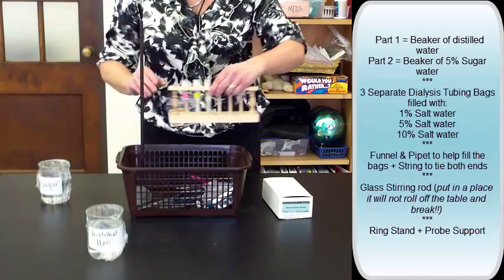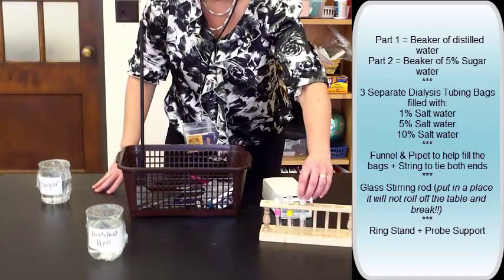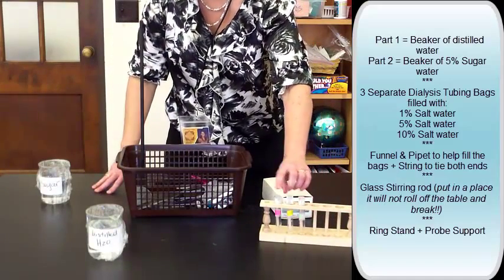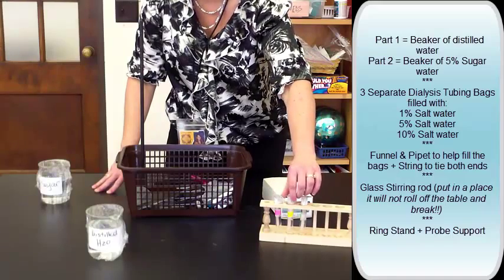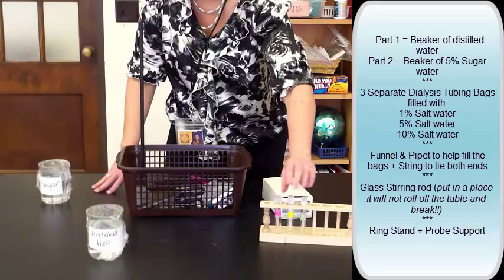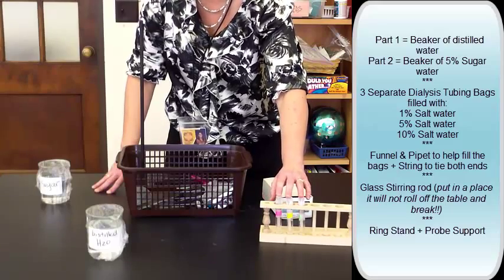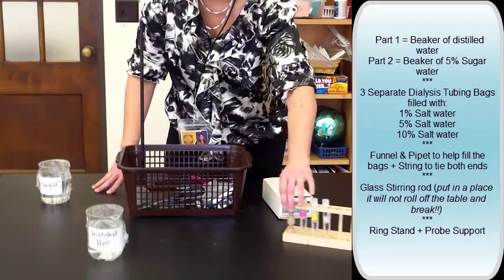You will have a test tube rack, and there are three test tubes. It has three different ratios: 1% salt, 5% salt, and 10% salt. These are the ones you will put in your dialysis bags when we make those shortly.